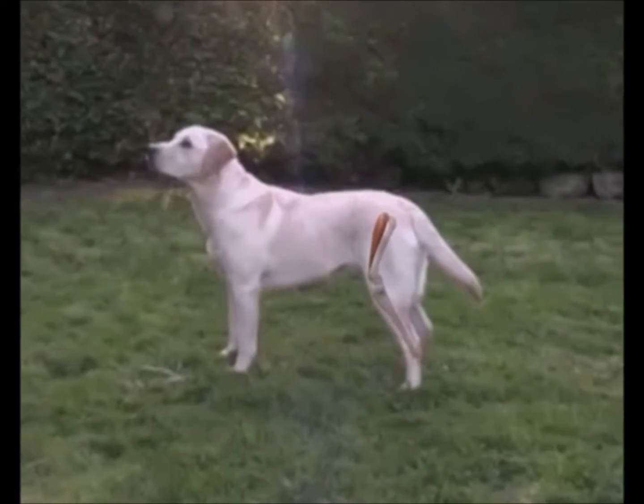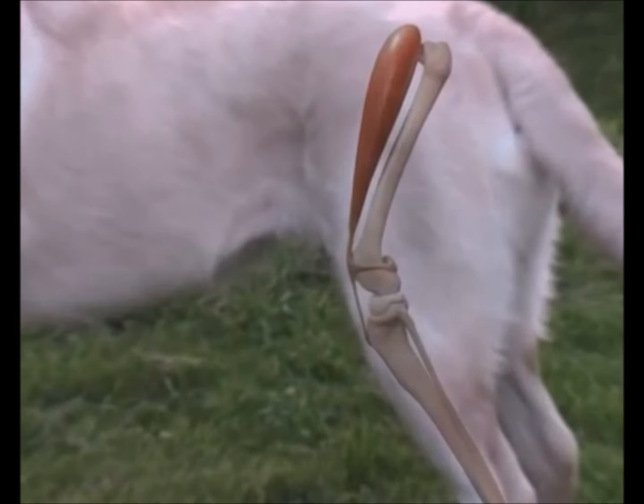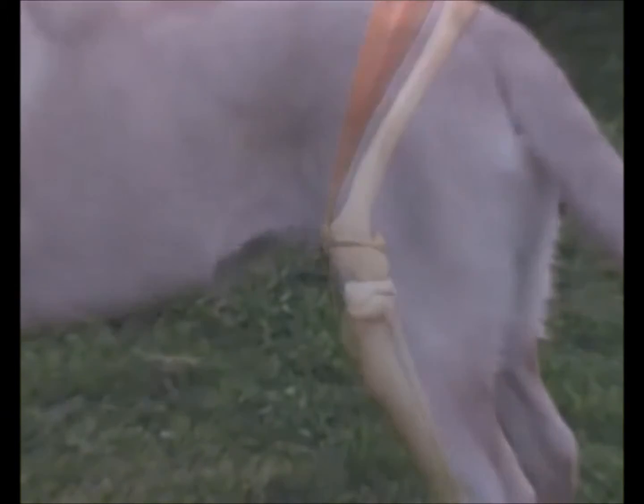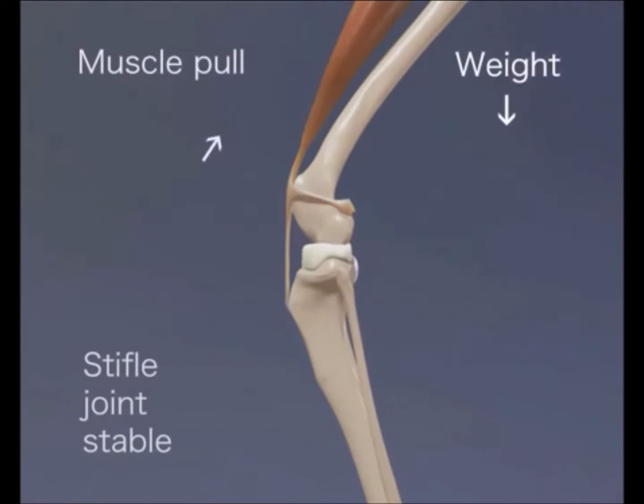The stifle is one of the largest articular joints in the body. A synovial articulation, it enables species to walk with a crouch gait, functioning to decrease an animal's center of gravity. This acts to reduce energy input, hence increasing movement efficiency.